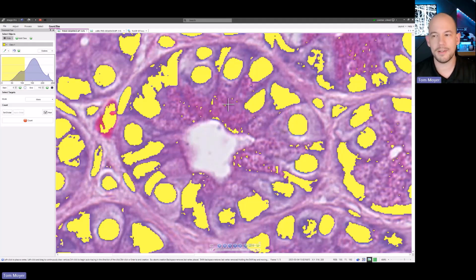It's going to be hard to gate these out. I can do some pre-processing to the image to try to increase contrast between different regions. But this is something that I can do once on a particular image. When I try to apply this same thresholding to another image, if I have any differences in terms of color values or intensities, it may not be a repeatable process.